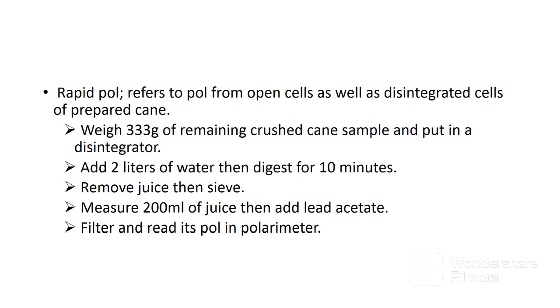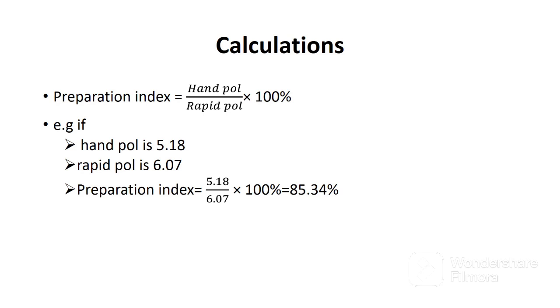The procedure for rapid pole is as follows: weigh 333 grams of the remaining crushed cane sample and put it in the disintegrator. Add 2 liters of water, then digest for 10 minutes. As the disintegrator shaft revolves, it opens the remaining cane cells holding sucrose and enables the sucrose to dissolve in the water added. Remove the juice from the disintegrator, then sieve. Measure 200 ml of juice, add lead acetate, stir, and filter using filter paper. Discard the first 25 ml of the filtrate, collect the remaining filtrate, and read the pole using the polarimeter.